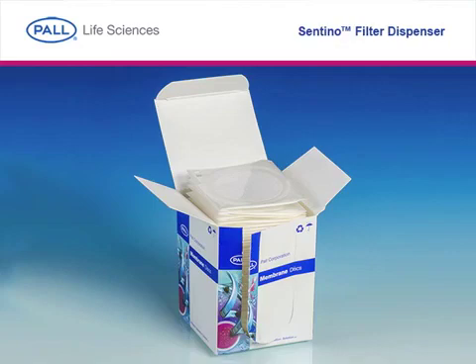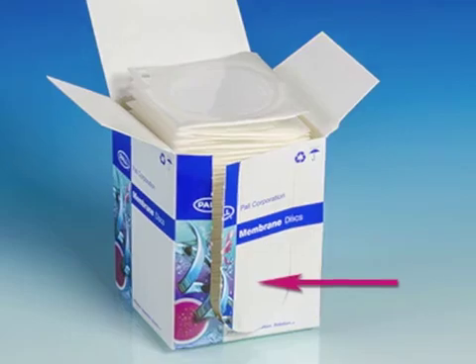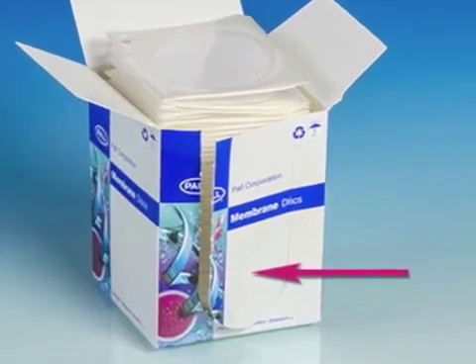To load, open the refill pack and remove the product insert and Paul Preferred Points coupon. Then detach the lid flaps. As an option, you can also remove the U-shaped cutout for viewing end of pack during use.